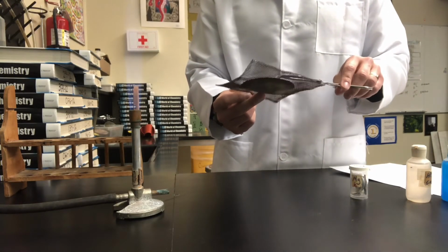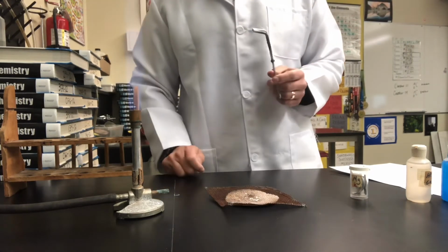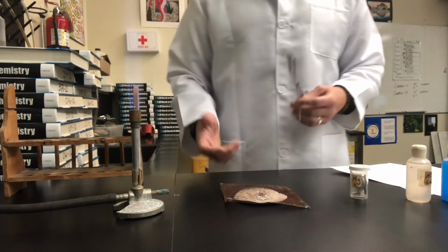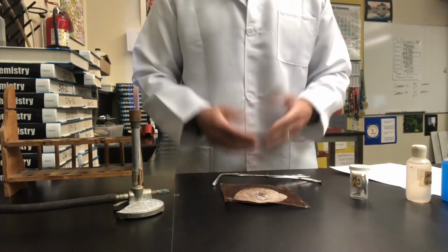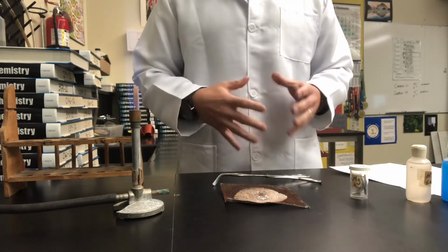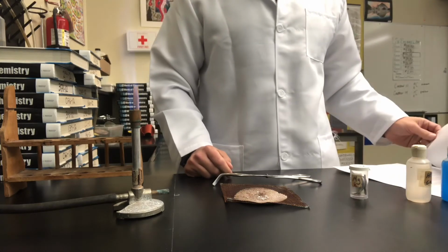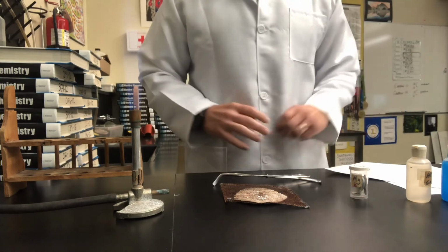Magnesium was actually used as an old flash for cameras at nighttime back in the day, and you can see why. It's a very bright light that's given off. So that was part A of your lab, magnesium reacting. Go ahead and write down your observations. Be sure to write down the observations before and after the reaction, but that was definitely a chemical reaction.